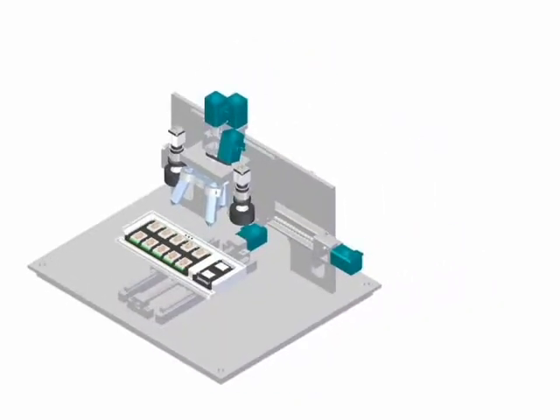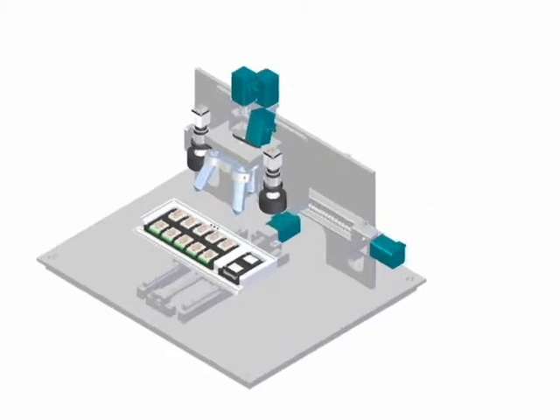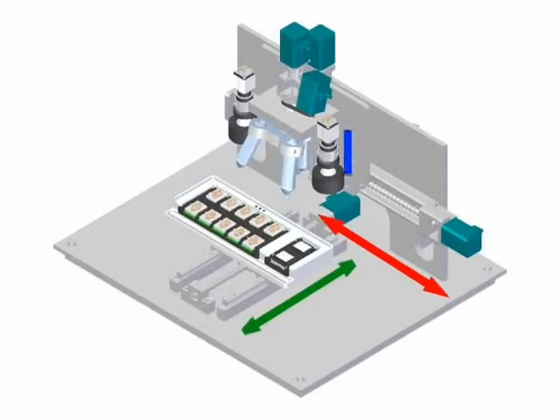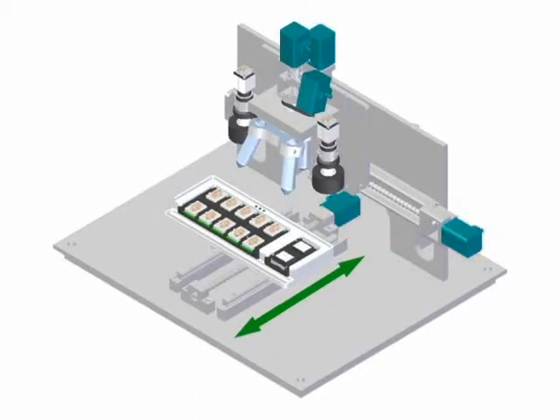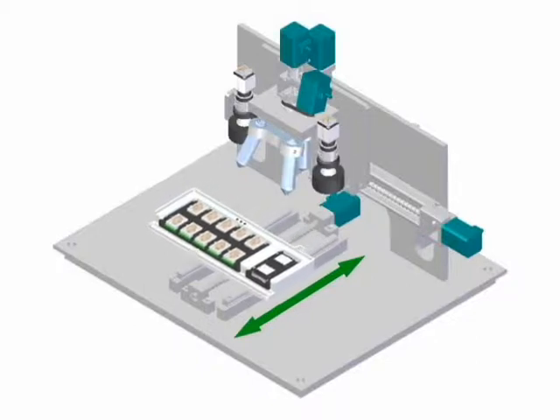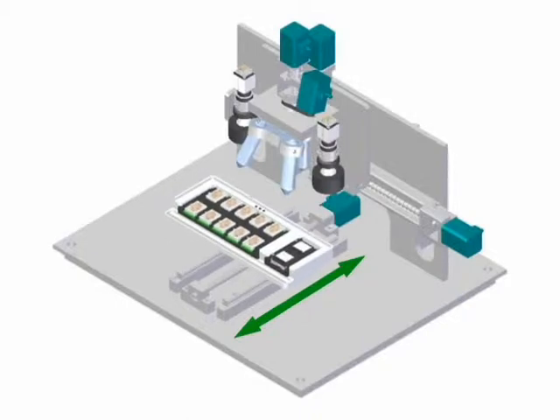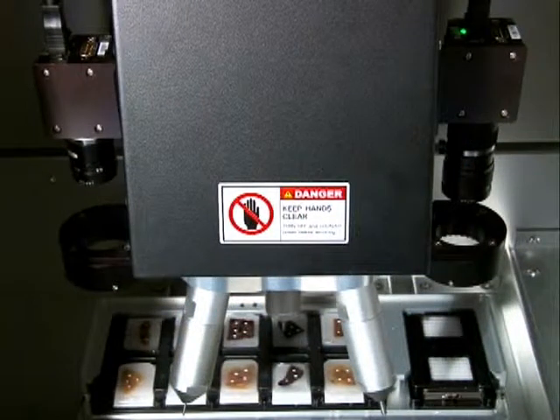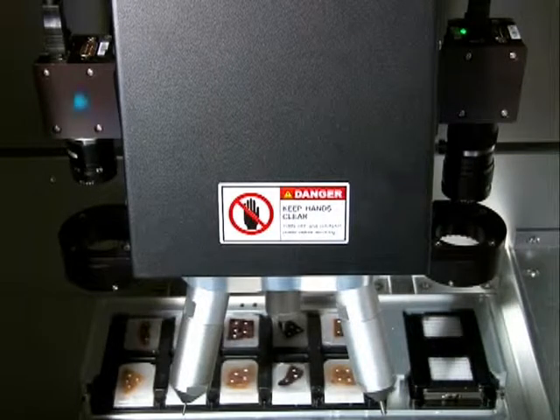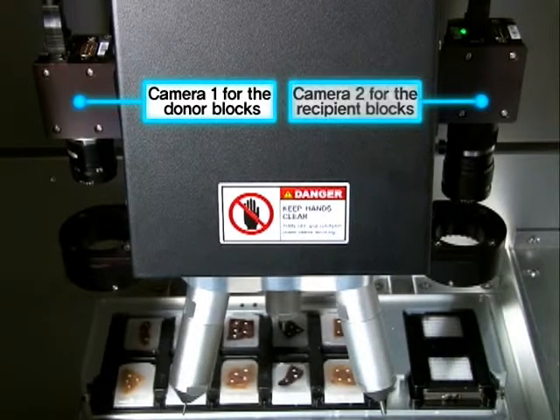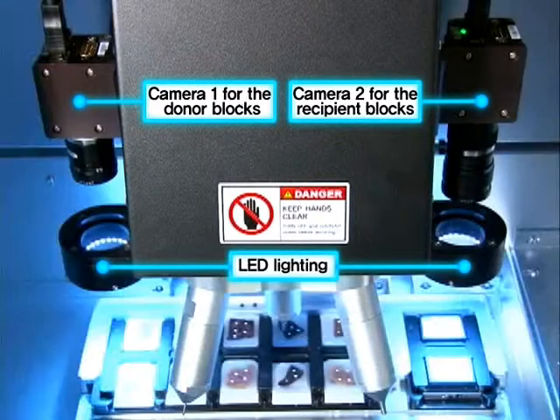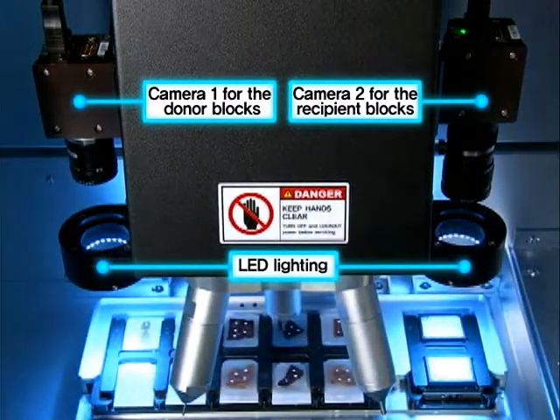The instrument part is composed of five axes. To easily move the puncher module in a 3D space, three axes are needed. With the main plate on the Y axis, the donor block and recipient block trays can be unloaded, and this structure is also applied when the puncher module is used. On the left and right sides of the puncher module are the cameras for the donor blocks and the recipient blocks. Under the cameras, LED lighting is built in to allow the cameras to recognize the targets correctly.